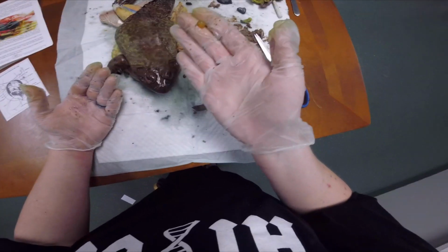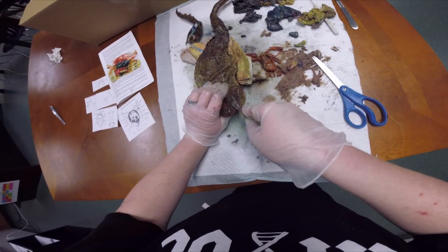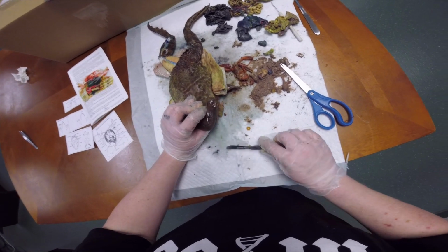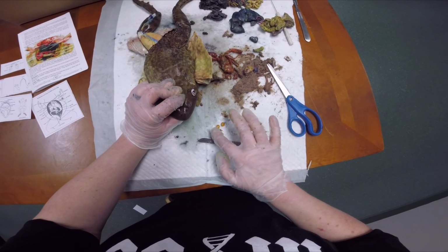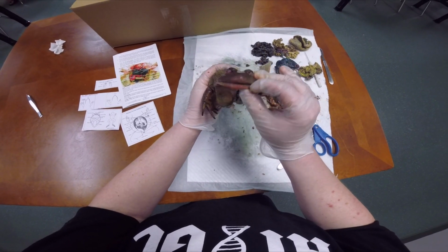So if you have time, you can pop out the lens and then try your hand at popping the other lens. Ta-da! You might flick it across the room, but there are the lenses. That concludes our dissection of the bullfrog.